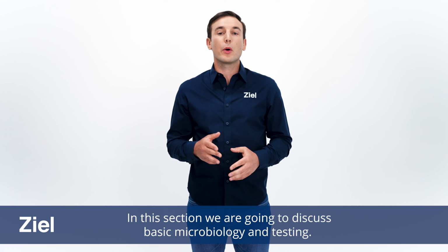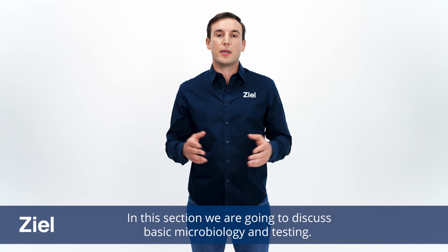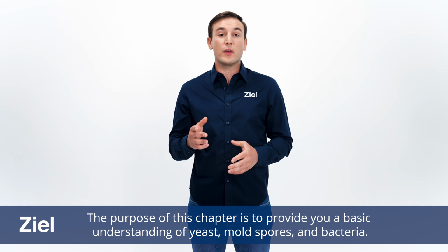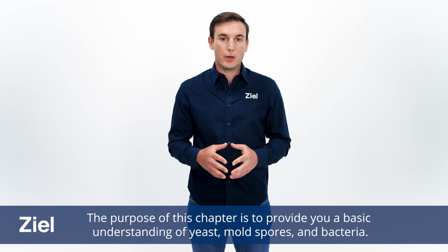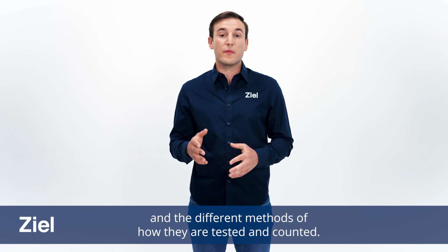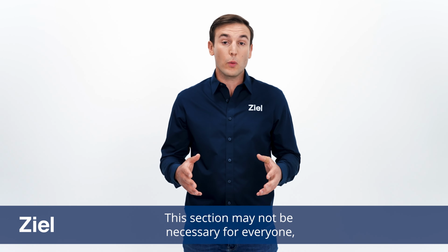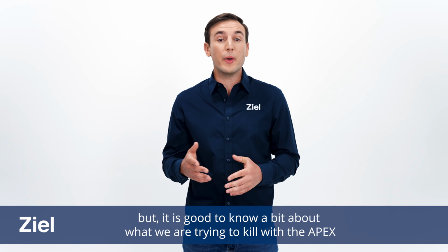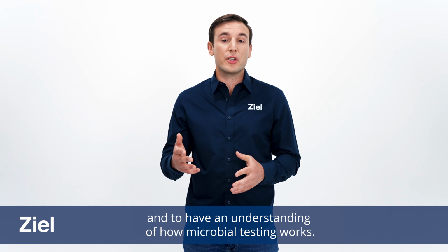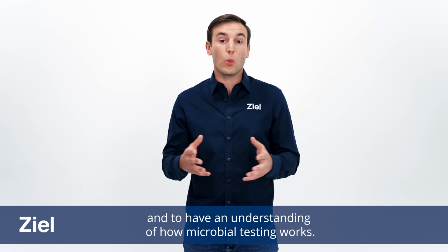In this section, we are going to discuss basic microbiology and testing. The purpose of this chapter is to provide you a basic understanding of yeast, mold spores, and bacteria. We'll discuss total yeast and mold counts and the different methods of how they are tested and counted. This section may not be necessary for everyone, but it is good to know a bit about what we are trying to kill with the Apex and to have an understanding of how microbial testing works.